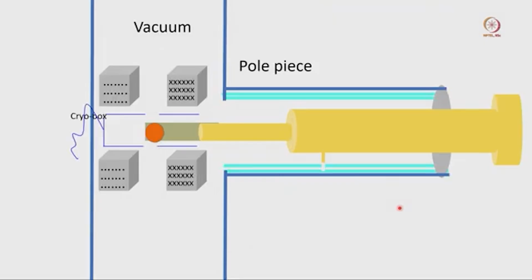Now, in the entire system that I told you about, those are the upper objective lens and lower objective lens, and the holder is inserted. This is the goniometer, and the pin and lock is the system. You can see the valve is completely open now and the holder can stay because this entire system is now under vacuum. This vacuum system we definitely have to discuss in the next class.